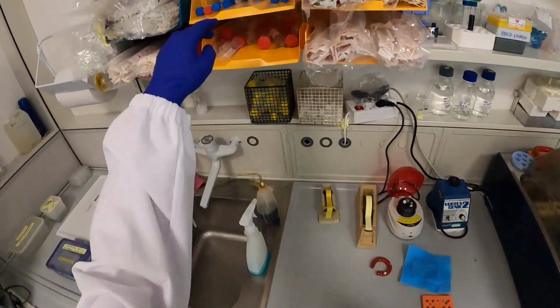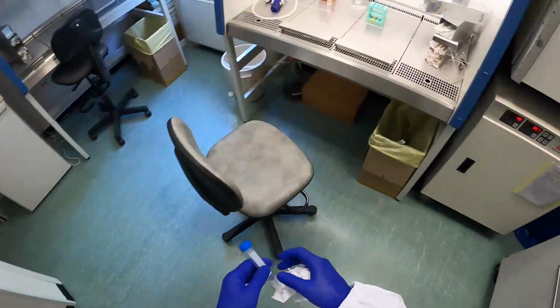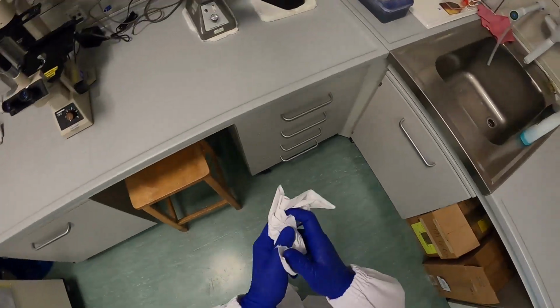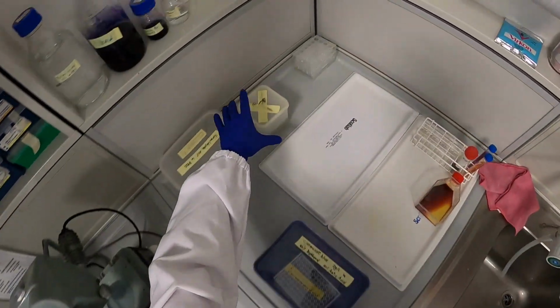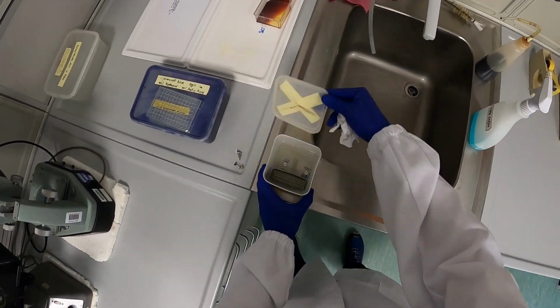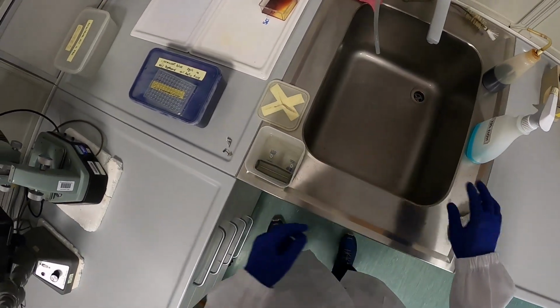We will also need a tube, because once the cells are trypsinized and detached from the flask, we will resuspend them, and then we will count them. And the counting we do with this device, which is in here, the hemocytometer, which is a glass slide.